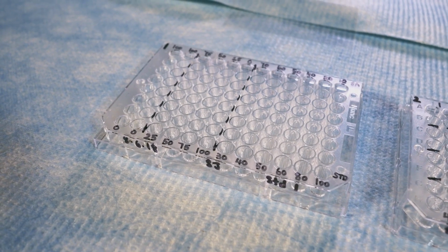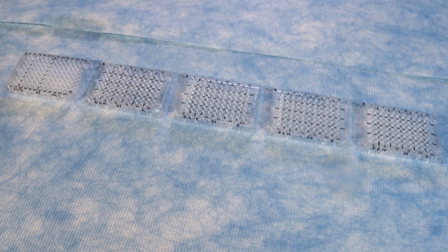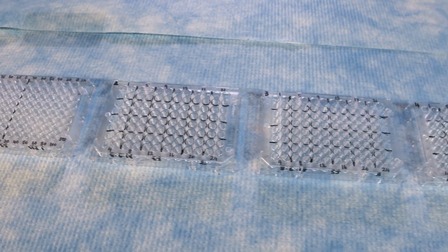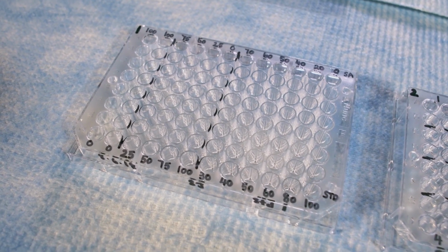Label each plate on the front with the date and analyst initial. Write the plate number on the upper left corner and on the front. Plate number 1 is used for the calibrator, and subsequent plates are used for samples. Write the different volumes of sodium ascorbate and calibrator for each column on the plate.